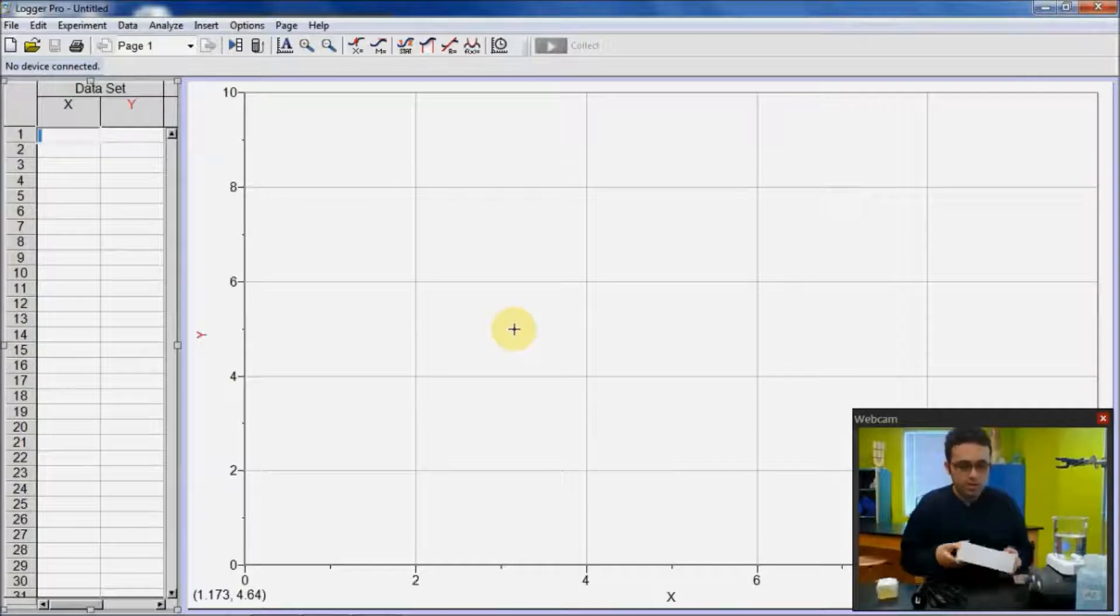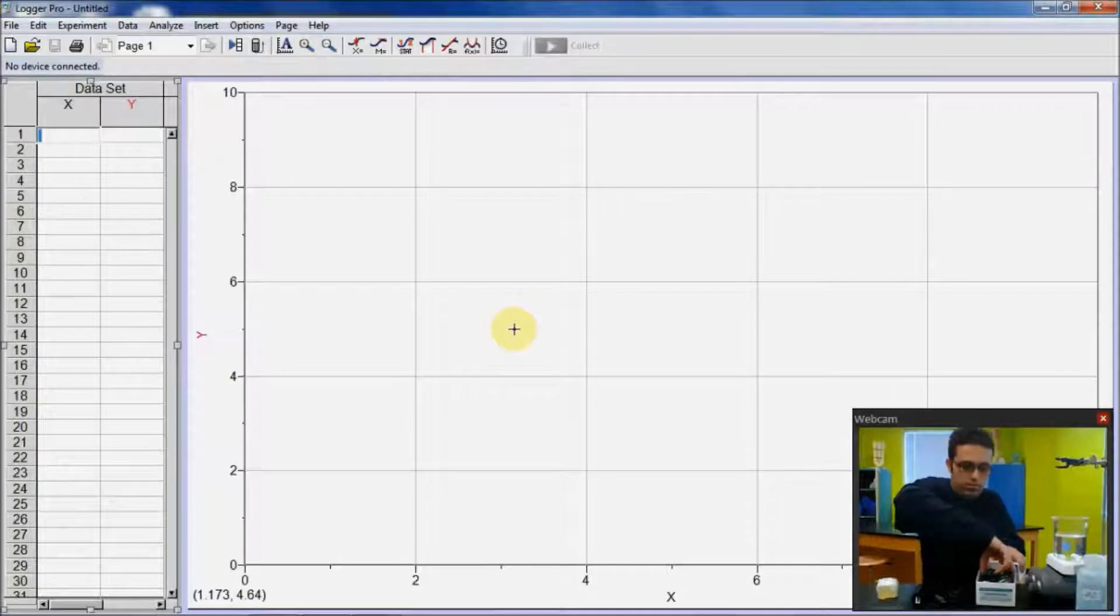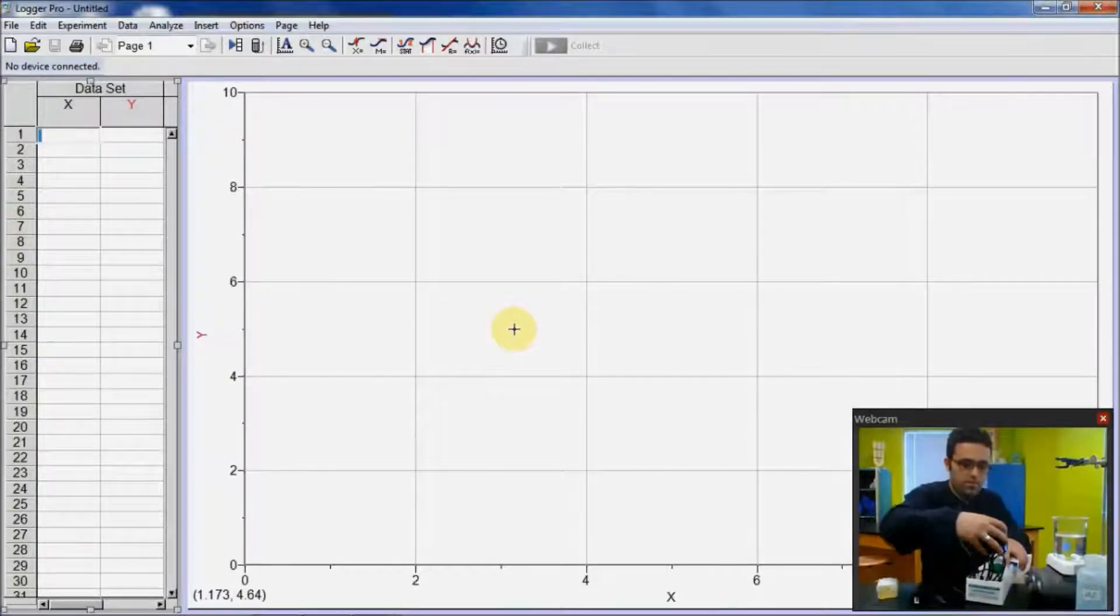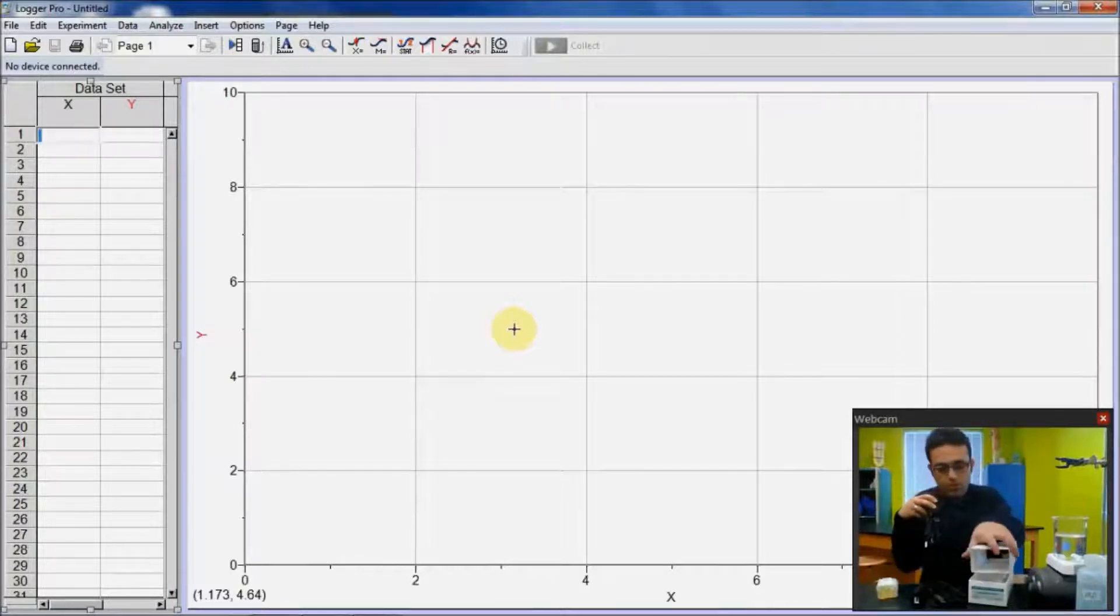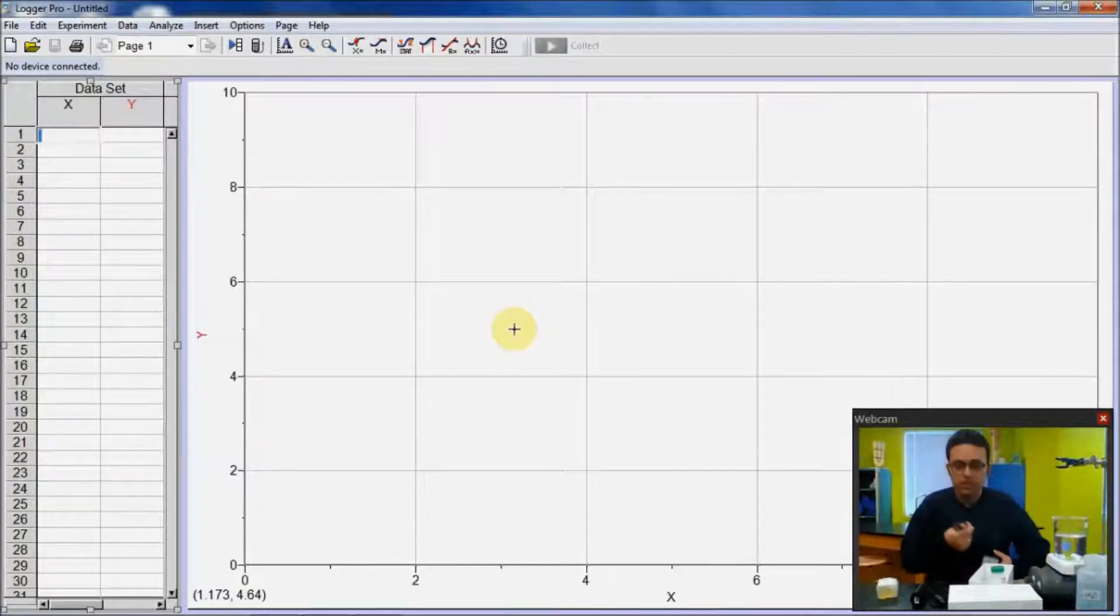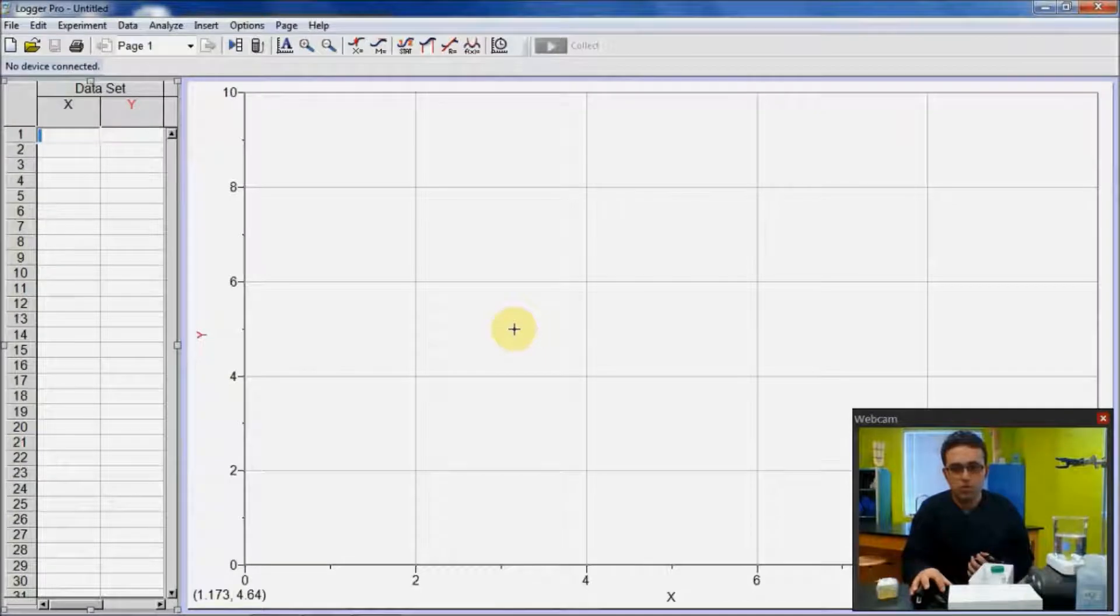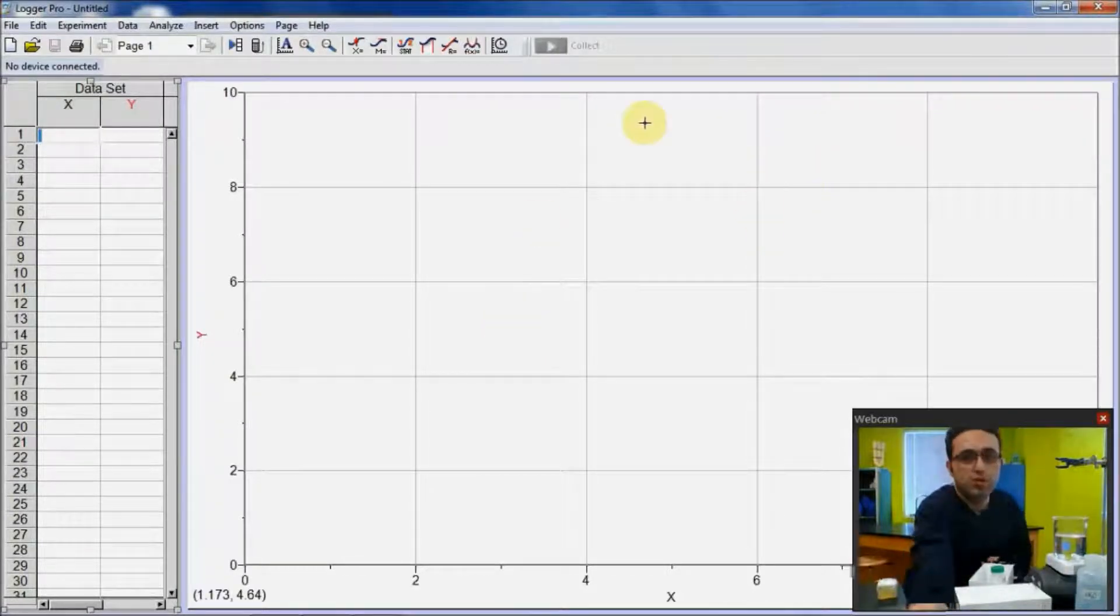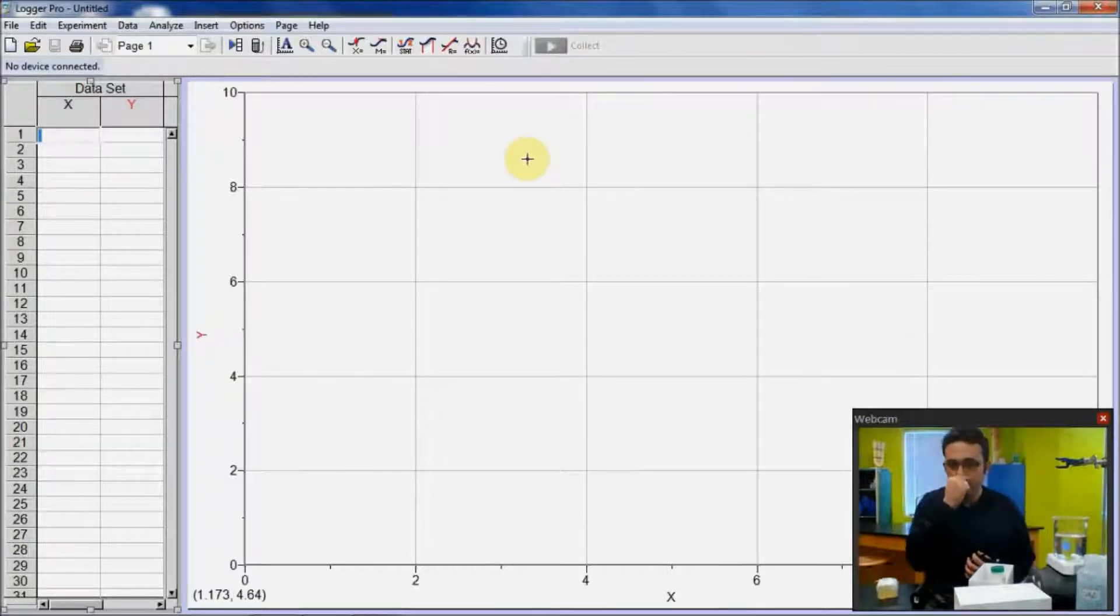And I'm going to connect my sensor into my laptop. By the way, you will need a data collection software to use your sensors. This that you should see here is Logger Pro. That's the data collection software of Vernier sensors and probes.